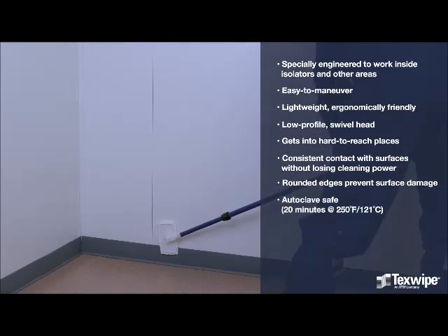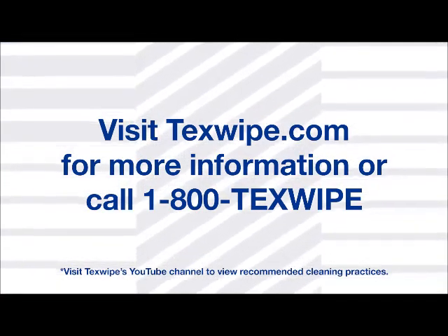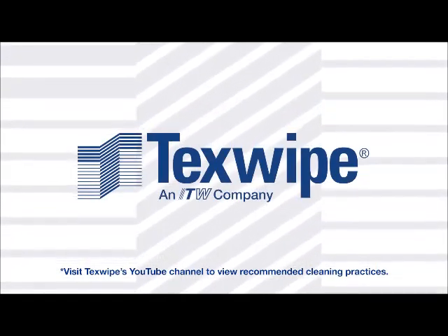It is autoclave safe. Visit Texwipe.com for more information or call 1-800-Texwipe.